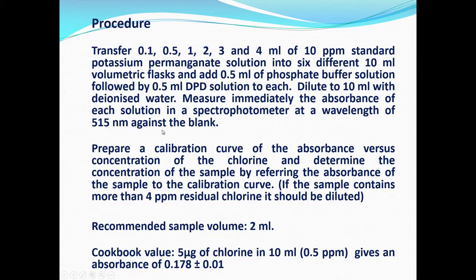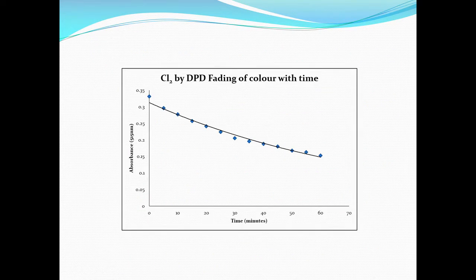So, what we have said here is, for the absorbance, you keep the time constant between each measurement. For each measurement, you have to maintain the same time gap. So, that should take care of the variation in the analysis.